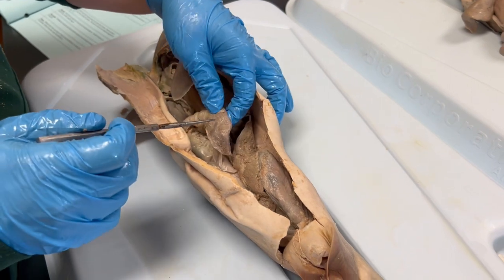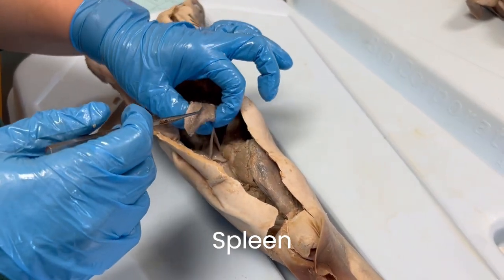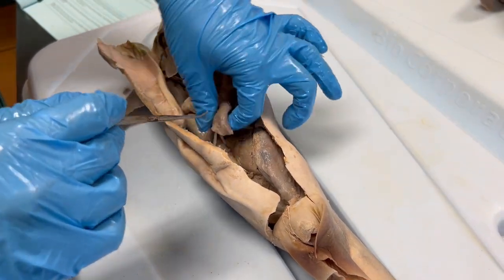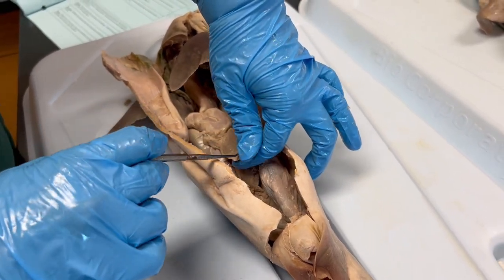The spleen is not actually a part of the digestive system, but it is located amongst the digestive organs. The spleen is responsible for creating red blood cells and it is also where the immune system functions to fight off pathogens.